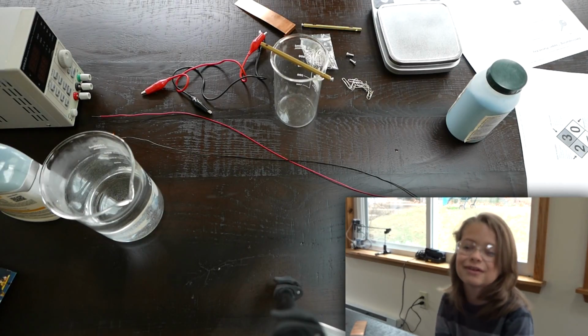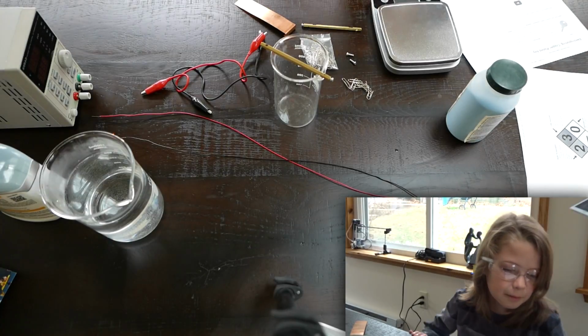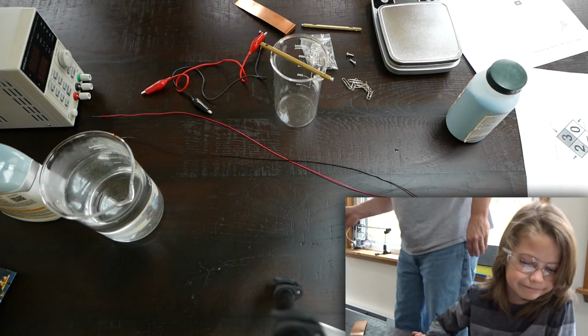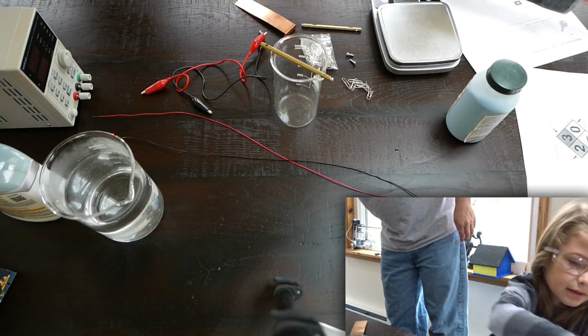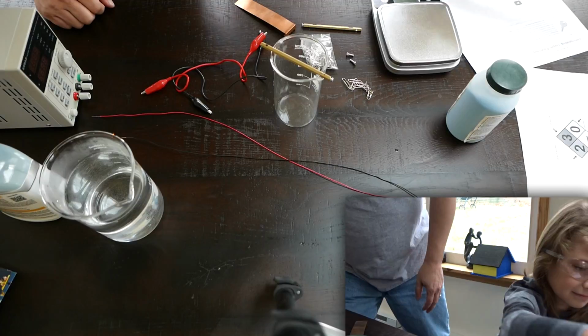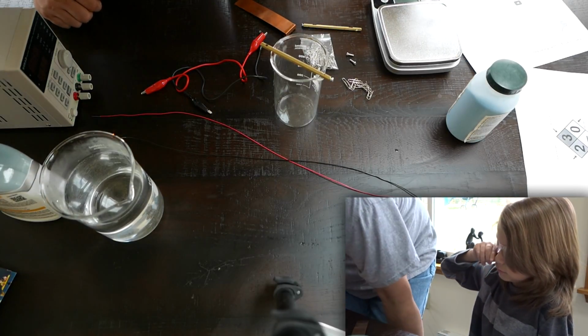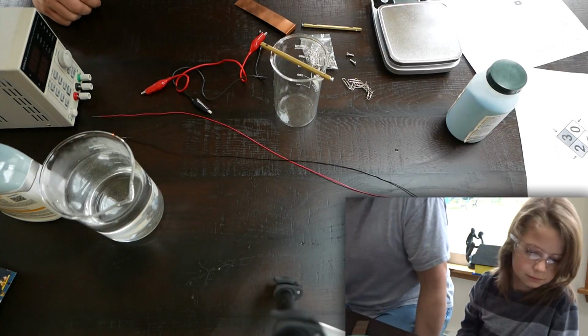Today we're doing electrolysis. Specifically for what? Electroplating. And what are we going to be electroplating? Some quarters and a fork. Alright, so this kit came from SCI, and let's go through what was in the box.